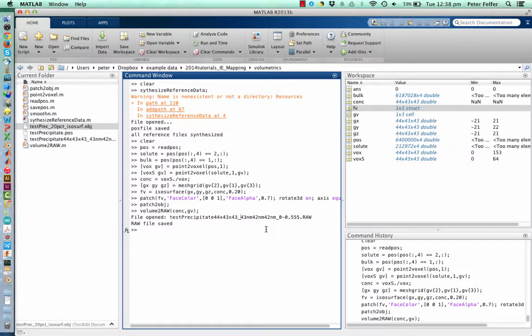concentration field. And that is important because it's integer numbers, so it can just do 0 to 127. And we want to use those numbers as well as we can. That's why it doesn't go from 0 to 1, but it goes from 0 to whatever your highest value is. But then in your dataset name, it tells you, okay, when you made that file, the highest value you had was 0.555. So that when you later create a color bar or whatever for your visualization, then you know that the deep red is not a concentration of 100%. Anyway, so we've got all of that here.